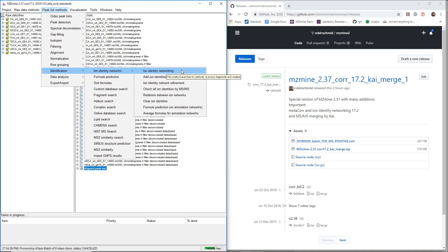You run ion identity networking and you just define the protonated, sodium, and whatever you expect to be in your data.